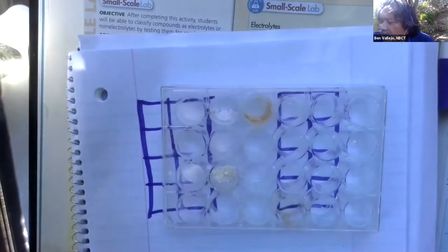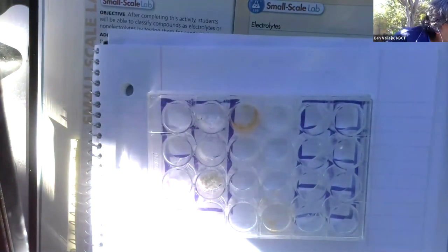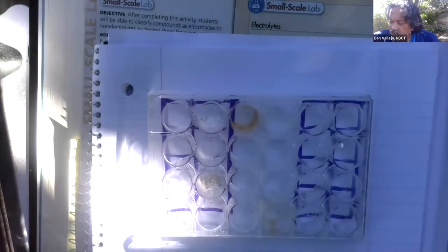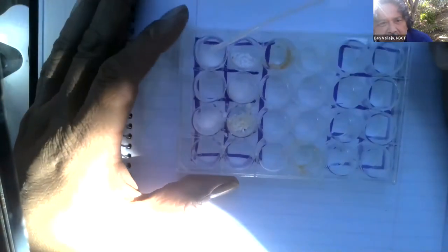And how many do we have? 1, 2, 3, 4, 5 solids. All right, I gotta go to my kit and get a dropper. So I got a dropper, and how much water? They say add 1 drop of water to each solid. I don't know if 1 drop's gonna do it. Whatever it is, it might be 5 drops. Whatever I put in this one, I'll just make them all the same.